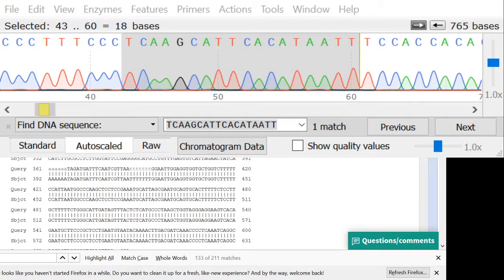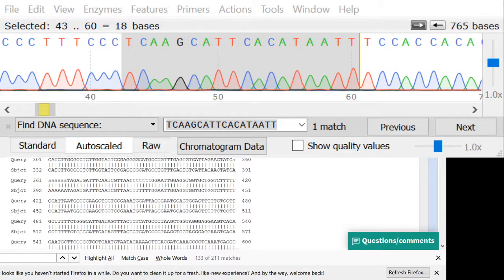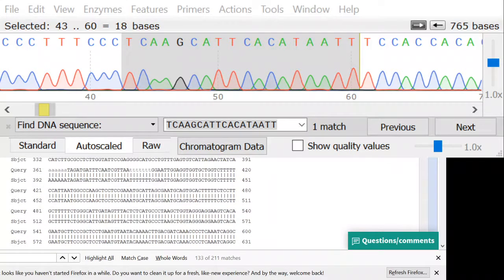But if there's a lot of differences and the sequences are clean, then you know for sure that it's a different species. If there's just a couple differences, 1, 2, 5, then it's a judgment call, and I look at other characteristics, not just the sequence. So in this case, knowing that 620 of these bases match, we know that we get a good quality read. The genes that we got, this is the ITS1 right in here.